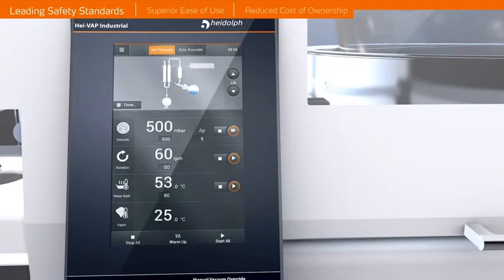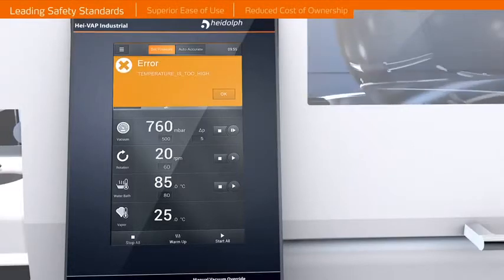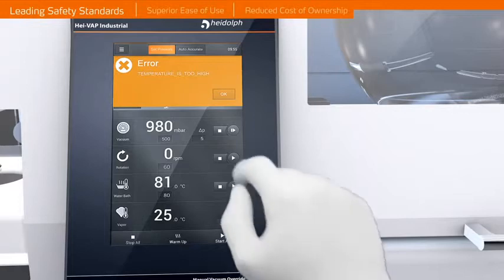In the event of an uncontrolled heat-up, an over-temperature sensor stops rotation, slowly releases vacuum and lowers the disabled bath. The system monitors a number of relevant safety and process parameters, resulting in an emergency shutdown. This is achieved with a safety alert caused by any over-pressure, glassware breakage, or a defective vacuum circuit.